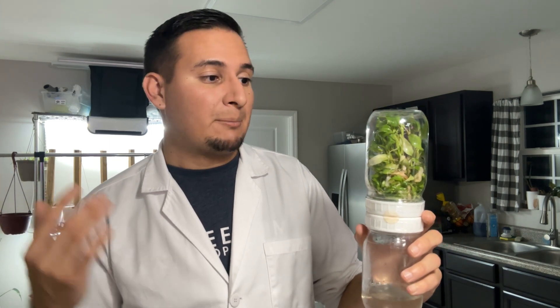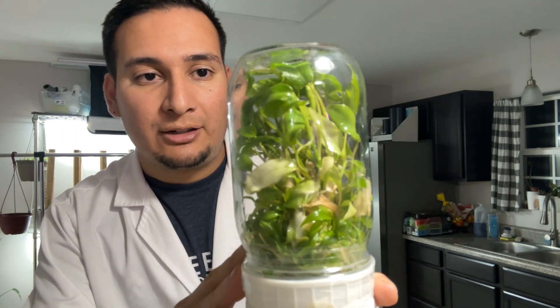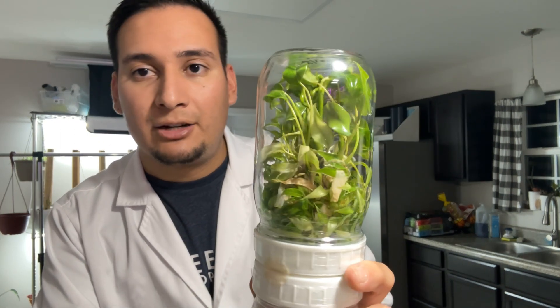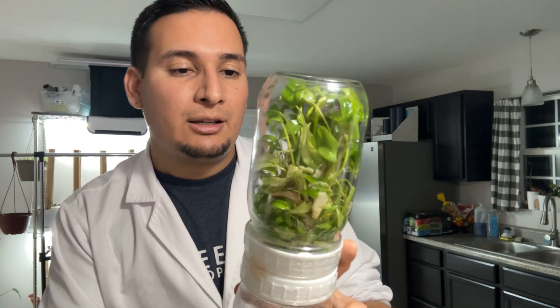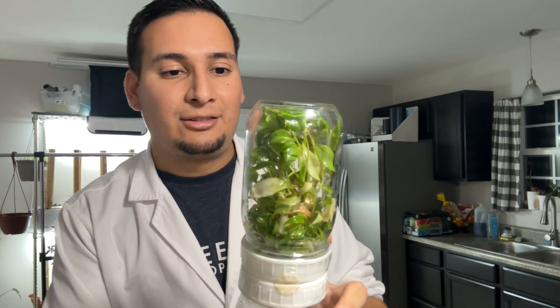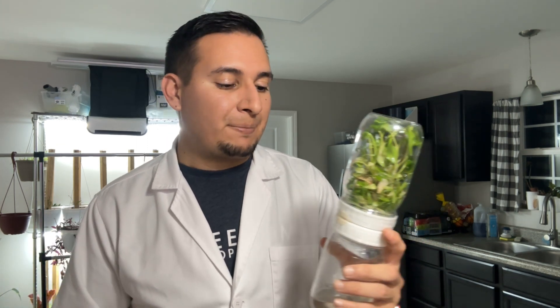This system allows the plants to grow faster and bigger. You can see how big these plants are — they've only been here for a couple of months and they look very healthy. They grow very fast and propagate a lot faster than traditional tissue culture media where you use a gelling agent.